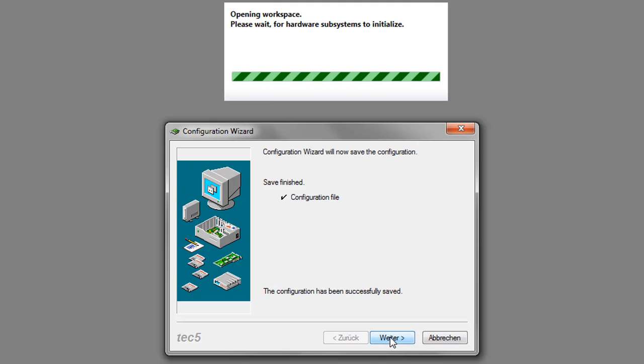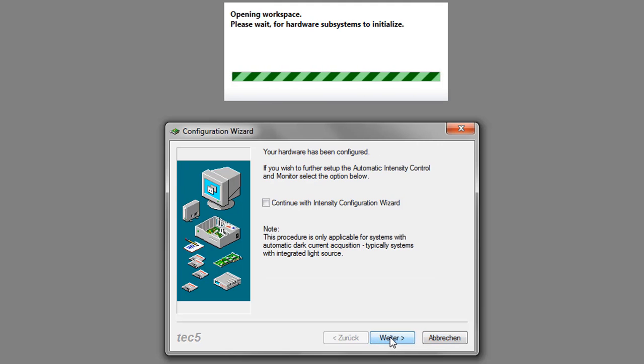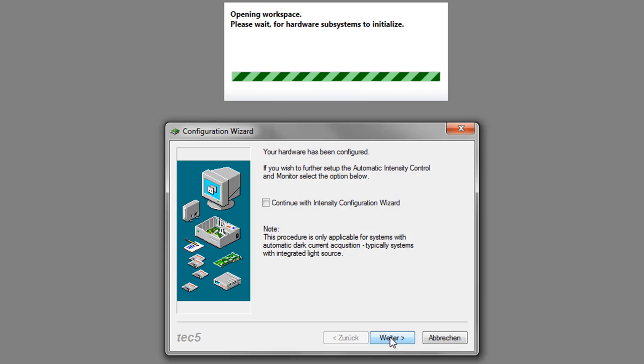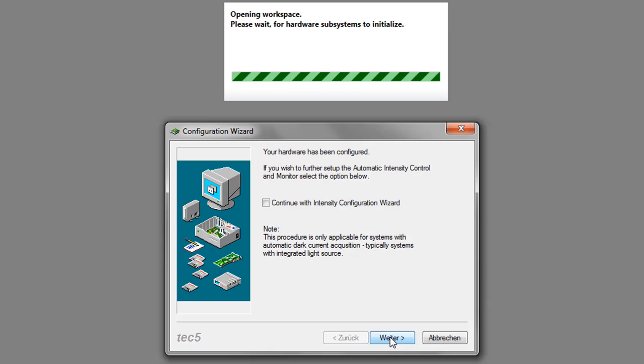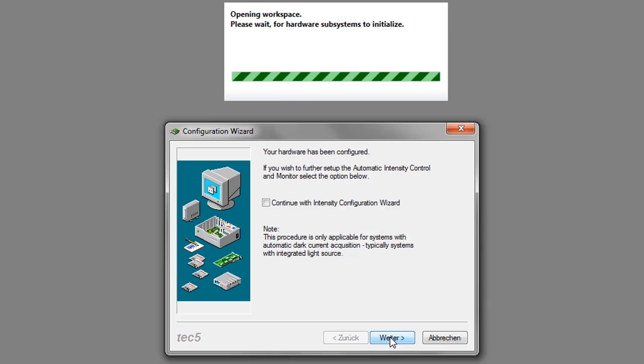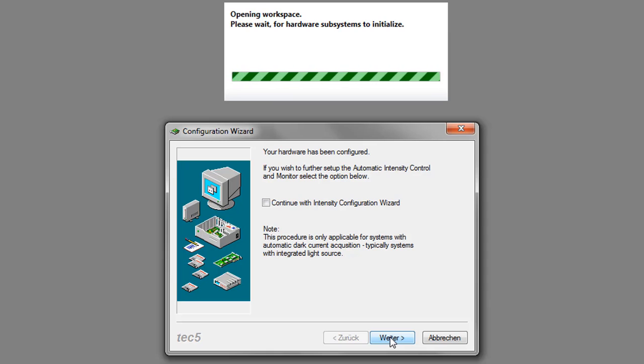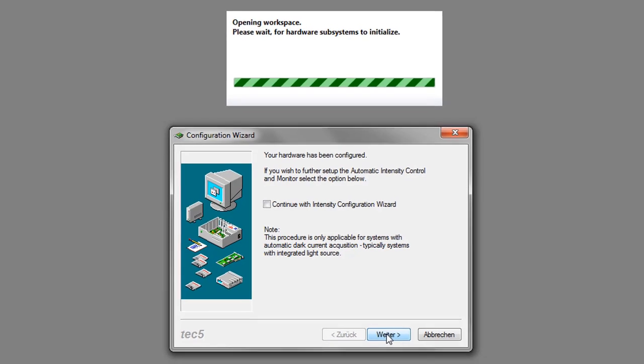The configuration file is now completed. You have the option to continue with the intensity configuration wizard, which is useful to find the right integration times for your system. I will continue directly, finish the configuration, and take it to the workspace.